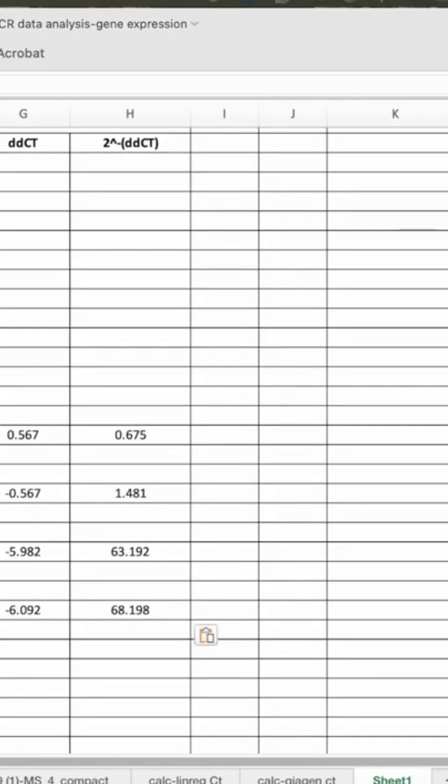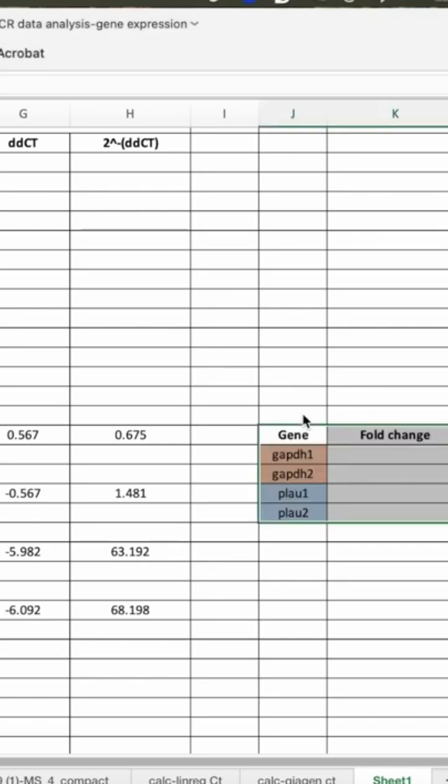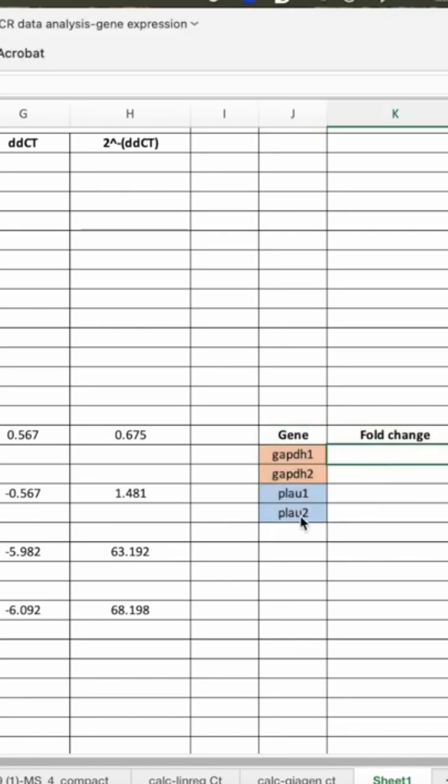So let's see this. So this is our target genes: PLAU1, PLAU2, GAPDH.